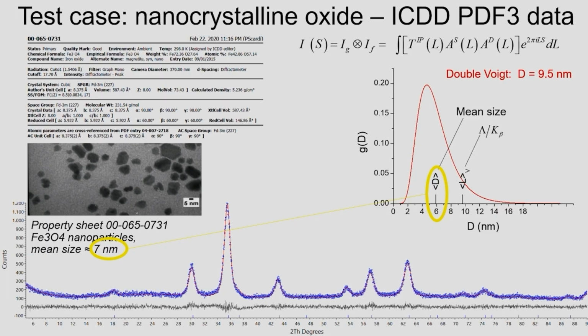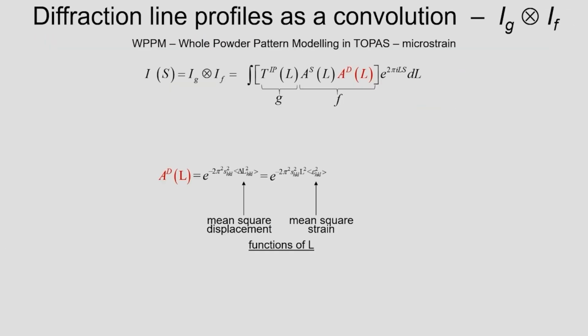And then you have a Fourier transform component. Now, the expression, which is pretty general, is this one. Sorry, it is very small for those who are sitting in the rear, but it is just an exponential function. And in the exponential, there is the square of the reciprocal space vector, which is basically the position of the peak, right?